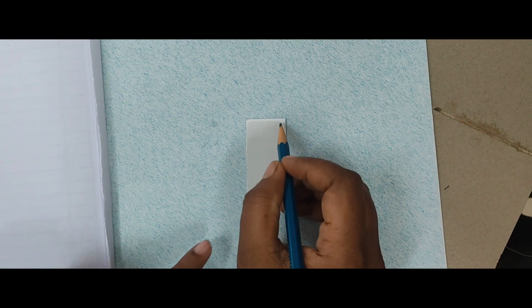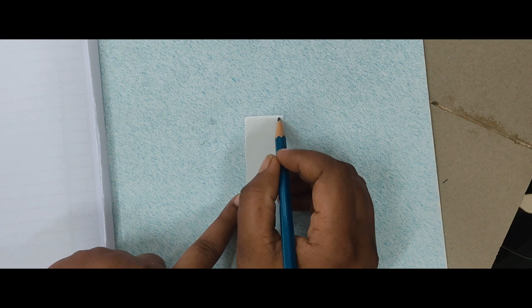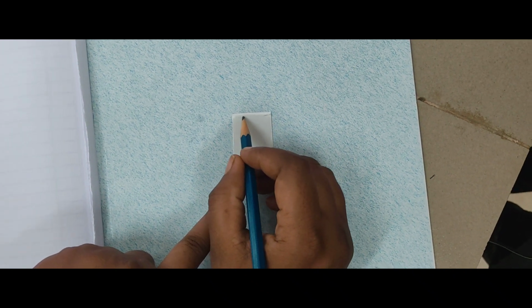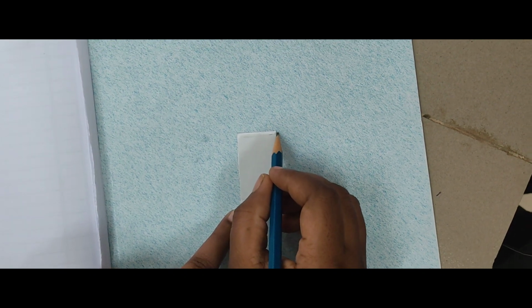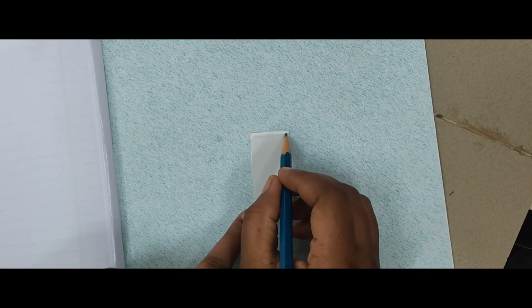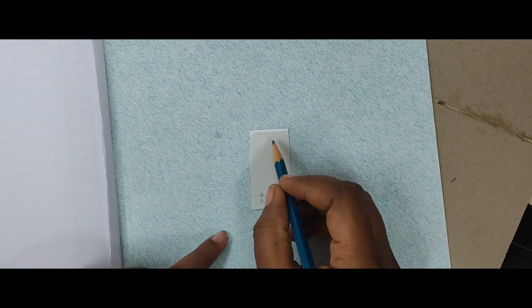After the solvent front reaches that point, remove the plate from the beaker and again draw a horizontal line at the top of the plate indicating the solvent front.